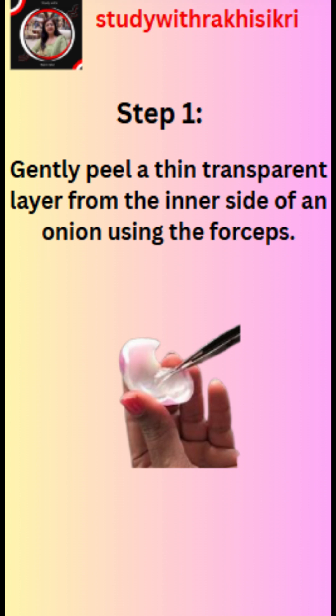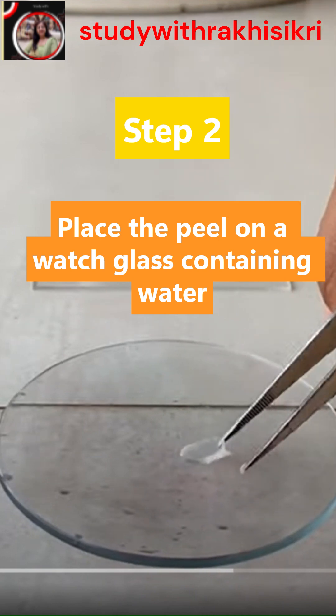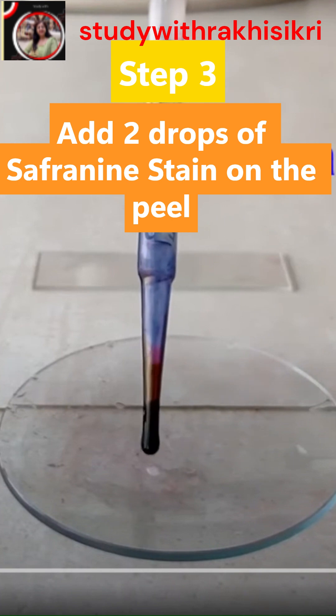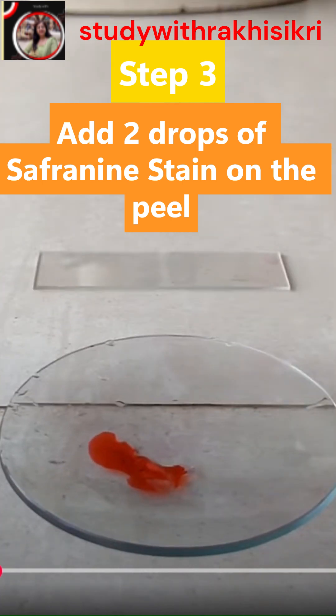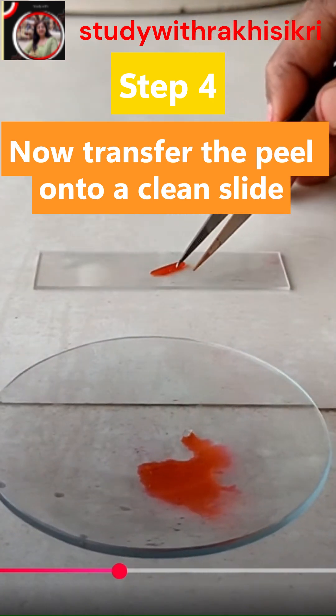In the first step, we have to gently peel a thin transparent layer of peel from the inner side of onion using the forcep. Then we need to place the peel on the watch glass containing water. Add a few drops of saffronin stain to the watch glass. Then transfer the peel onto a clean slide.